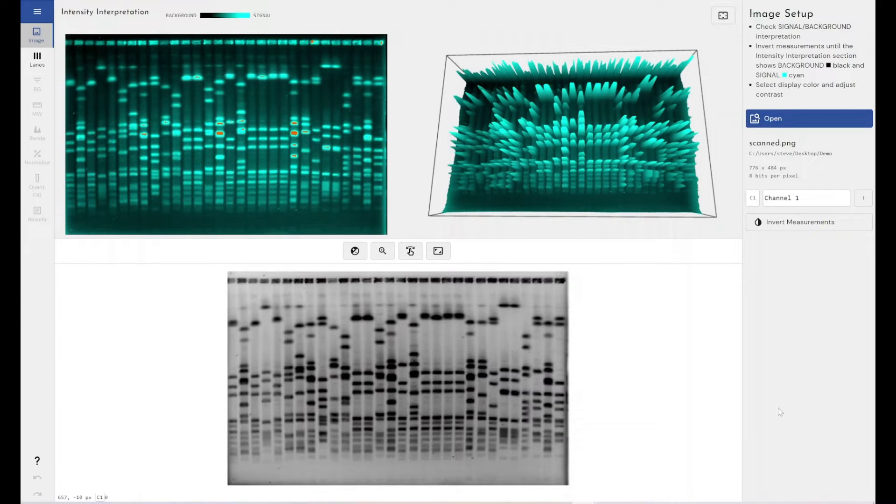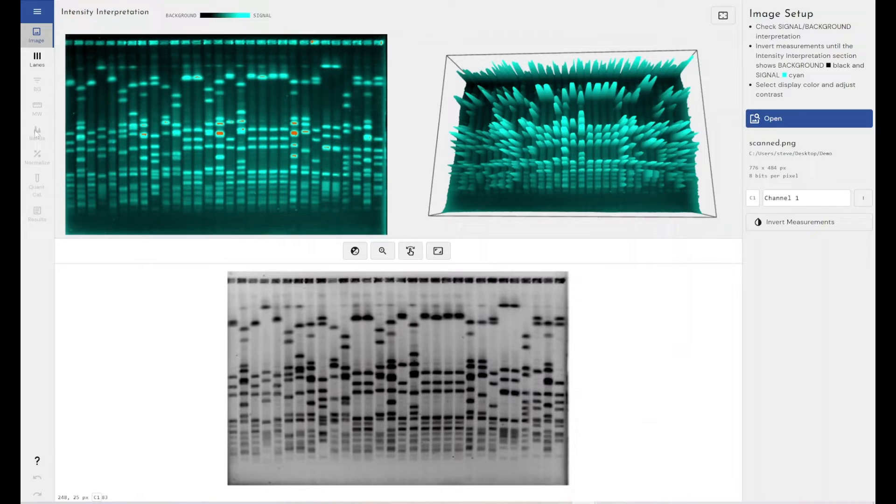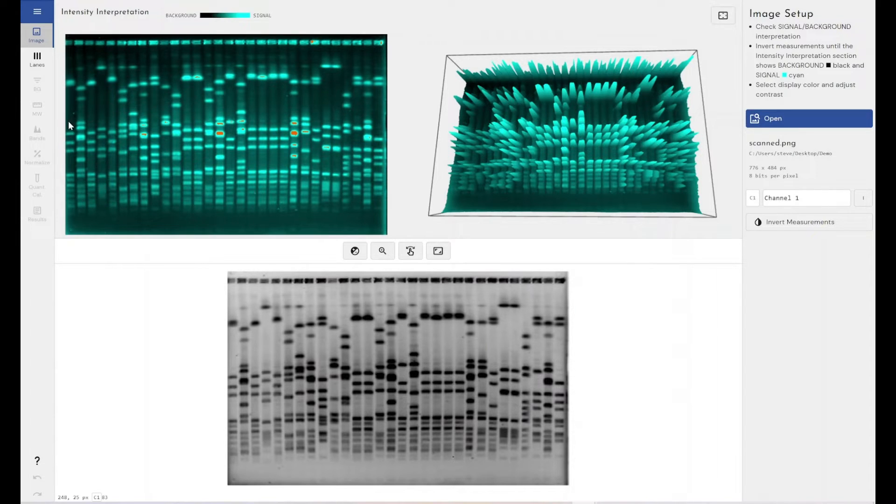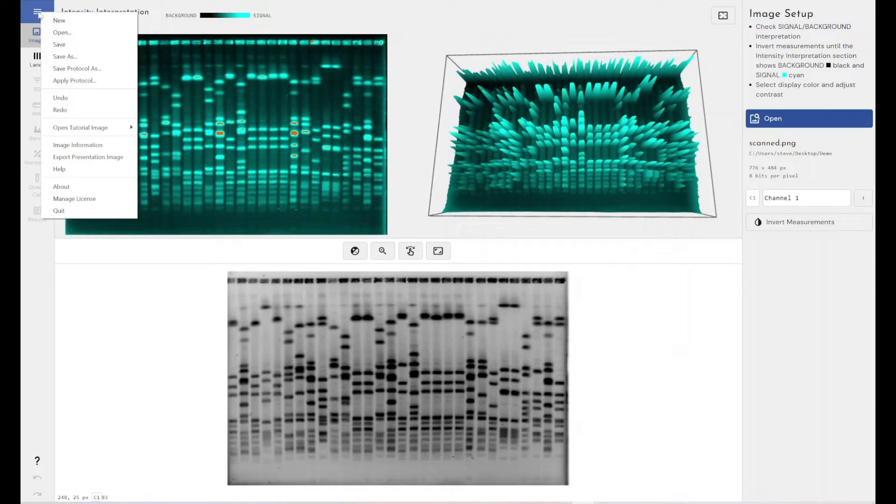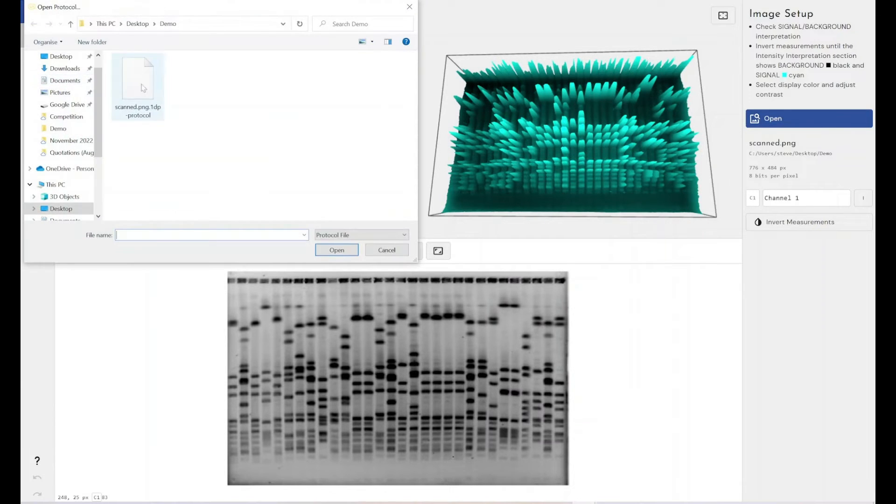As you can see here I've got an unanalyzed image in front of me. I've not gone through any of the workflow within Phoretix 1D to analyze this, but I do have a protocol that I can apply to this that I've pre-prepared. So all I need to do to apply that protocol and to automate the analysis of this gel is to click on the main menu and click on apply protocol.